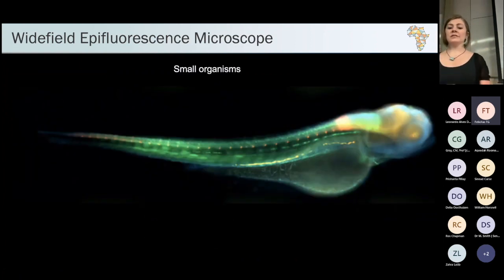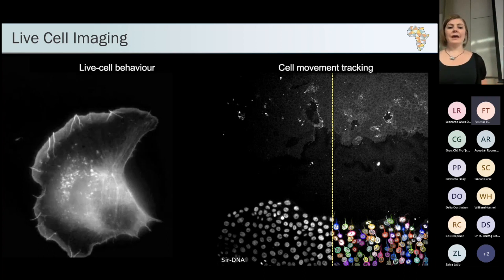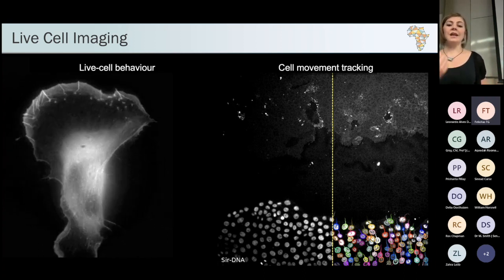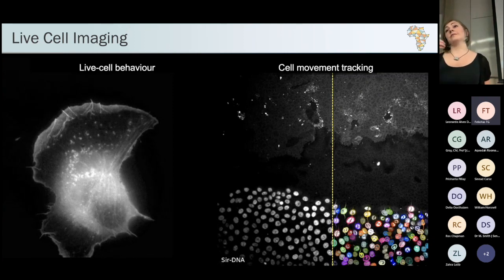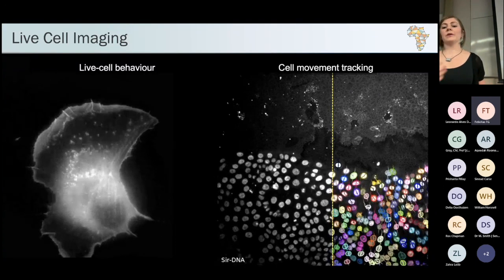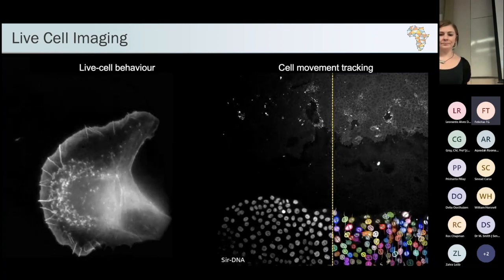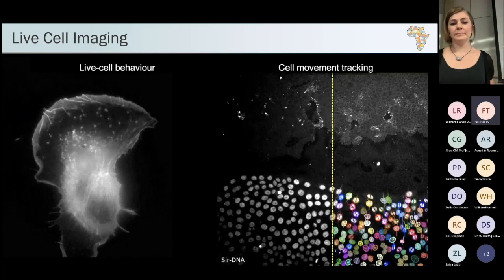And if we're interested in larger samples, we would be switching. And again, as I mentioned, live cell biology, with the importance of bringing that time component and being able to look at the dynamics of cells, of components, as well as the power that quantification can now bring into that, where you can actually extract key parameters about cell movement, directionality, and other questions that you might be interested in.